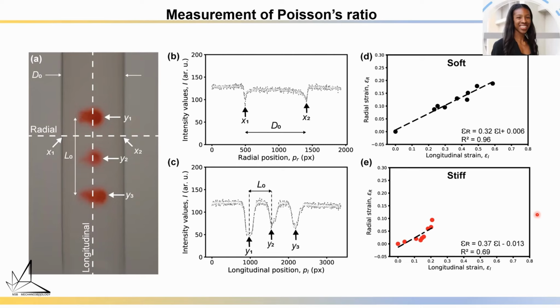Although the Young's modulus of polyacrylamide hydrogels and elastomers such as polydimethylsiloxane are well known, their Poisson's ratio are often overlooked or assumed to be 0.5, which means that the substrates are incompressible. However, that is not the case, and we decided to use a very simple static tension test method to determine both the Young's modulus and the Poisson ratio of our substrates.